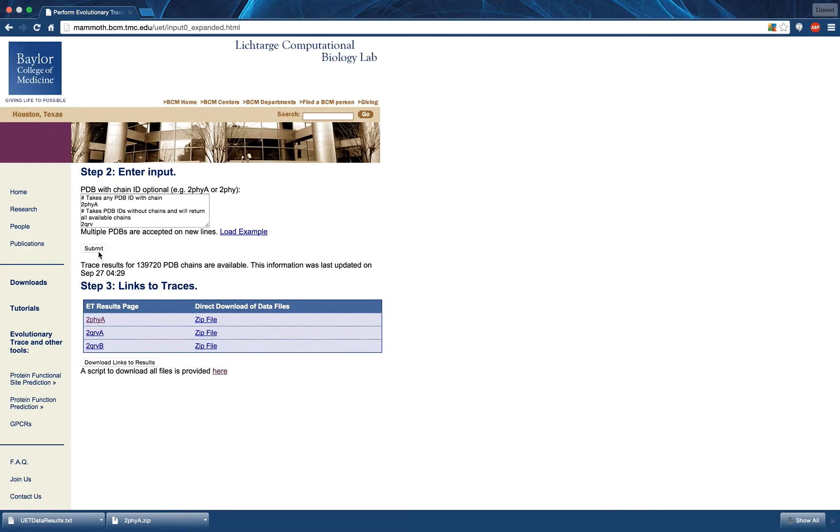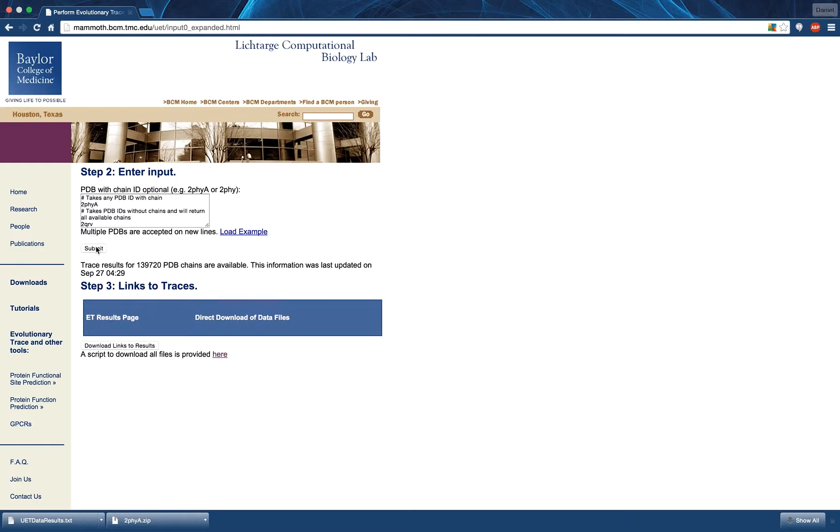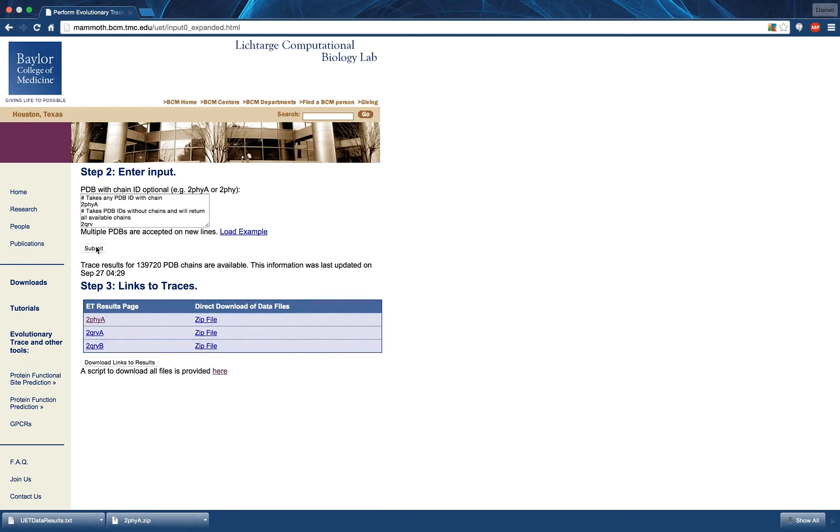Pressing the submit button after entering such a list will produce a table of relevant results. The results for each structure returned in the table can be downloaded by pressing the zip file link on the right side of the table.